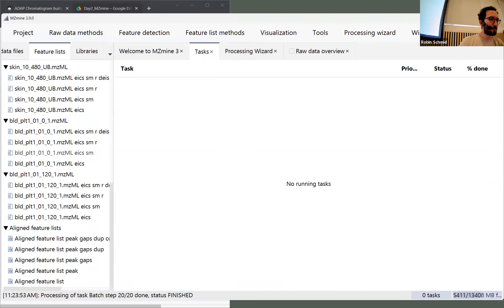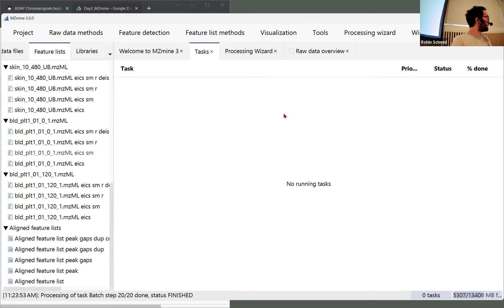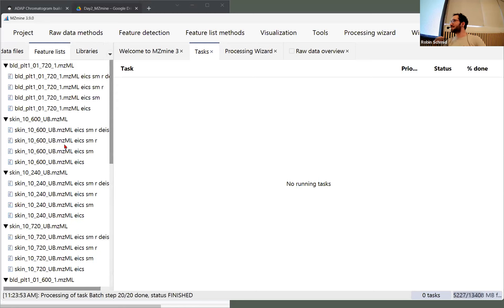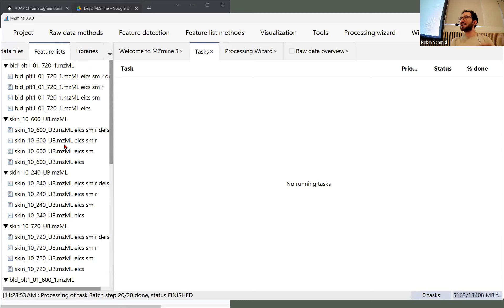The first thing we're going to look at — are you seeing the screen now? Good. So I hope everyone got to process, and we know there's usually some hiccups because maybe someone didn't select some files, or there are so many things that can go wrong already.